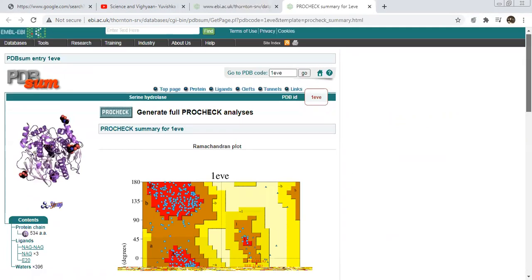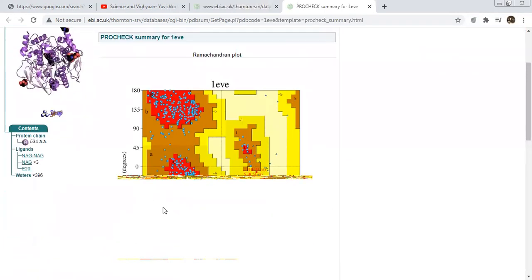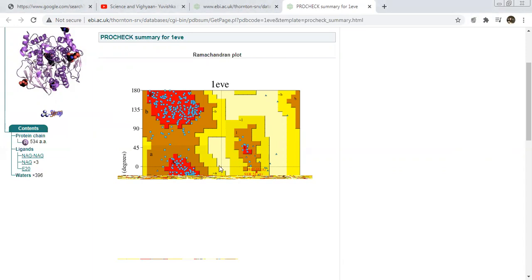It looks like this — you can see this is the Ramachandran plot. If you want to interpret this Ramachandran plot, on the right side this is the favorable region, and on the left side the red mark is the disfavored region. Just click on it and after that we can know which amino acid is present in the favorable region and which amino acid is present in the unfavorable region.